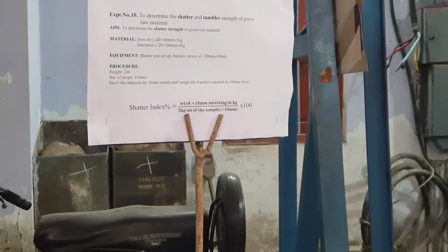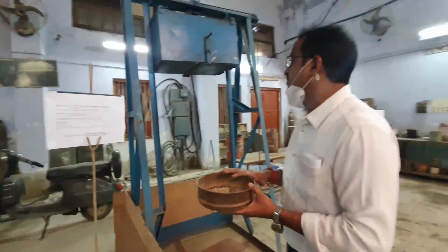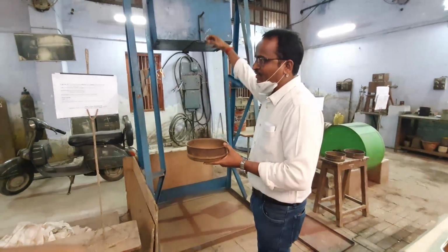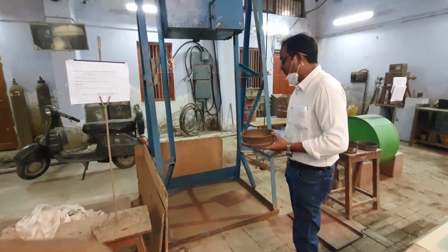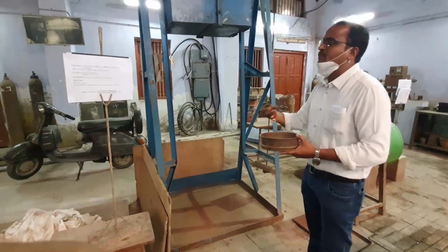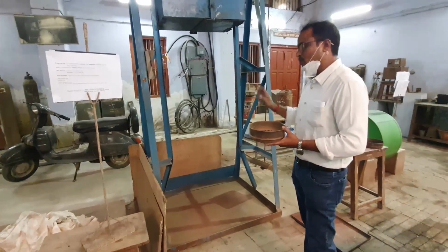Means in this experiment, what are we going to do? We are subjecting this iron ore or limestone, whatever the raw material we are taking, to impact by freely falling. That freely falling material is falling on the base steel thick plate. So when it is subjected to impact loading, what will happen? It will break into fragments. Like that we repeat this experiment 4 times.